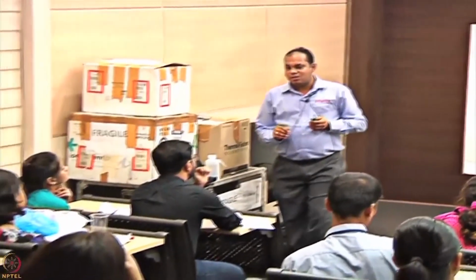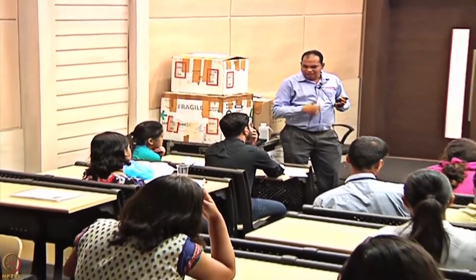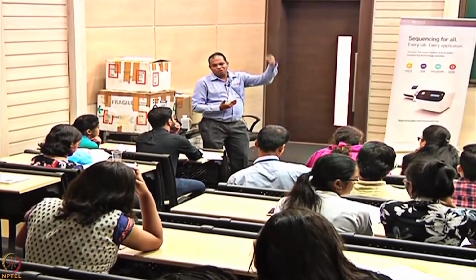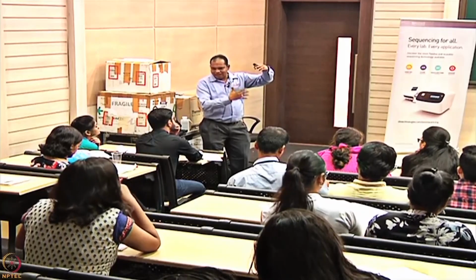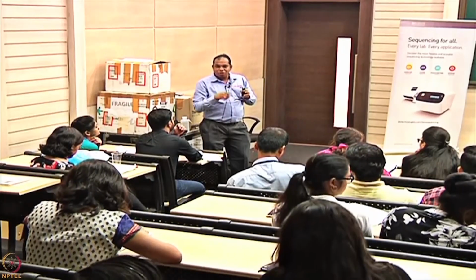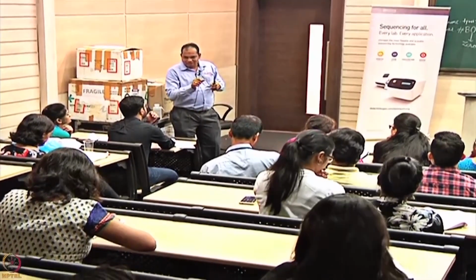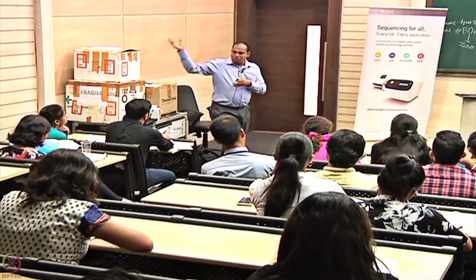It's not single base resolution. It is like when you are taking a reference genome, you are aligning a sequence. I'm just trying to know whether a single base is covered by one read or not. Alignment is nothing but you have a reference, you have a read getting aligned to it. There may be 1,000 reads that are getting aligned. So I'm just trying to get to know how many reads cover that particular base in the genome. If I have something like one read passing to it, then it is covering that particular base. So that is the first stage actually. Once that is done, it is taken further and aligned to the reference genome.